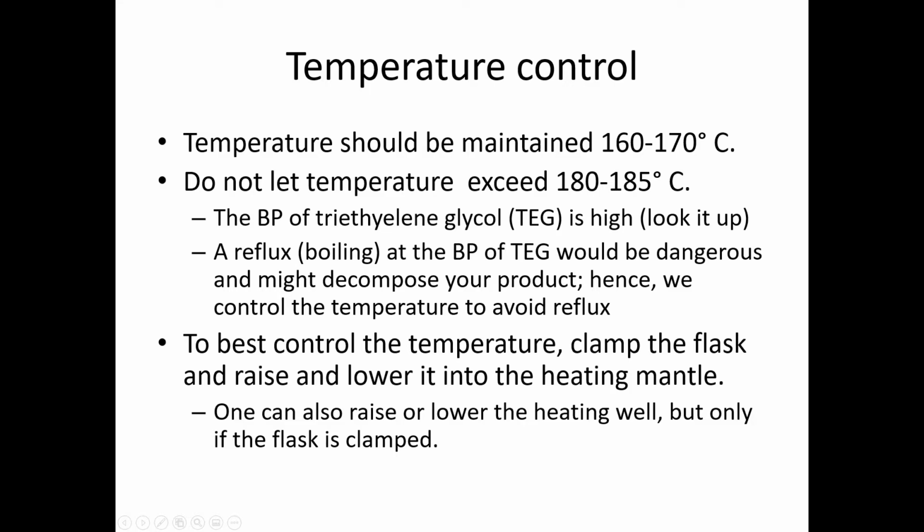The good thing is that the boiling point of triethylene glycol is a bit high, so we don't really have to worry about our triethylene glycol boiling. However, a reflux or boiling at the boiling point of TEG would be very dangerous, and it could even decompose our product, which is why we want to control the temperature to avoid this boiling.